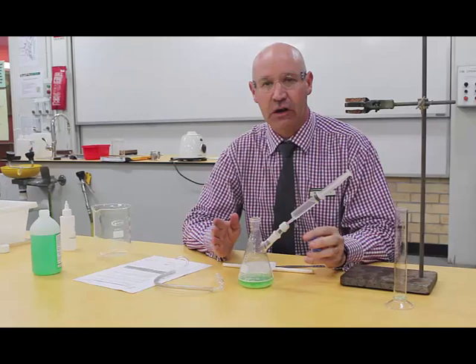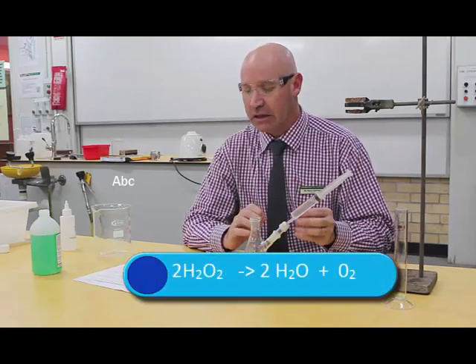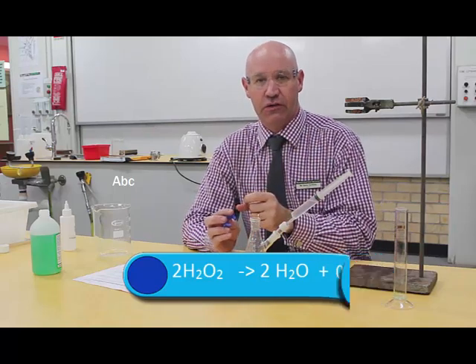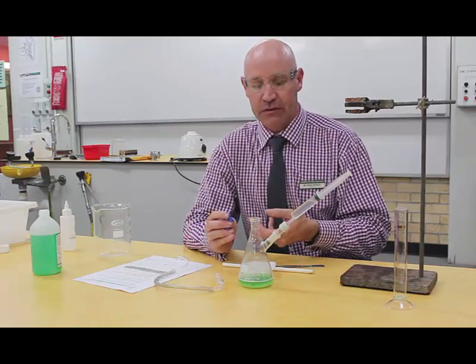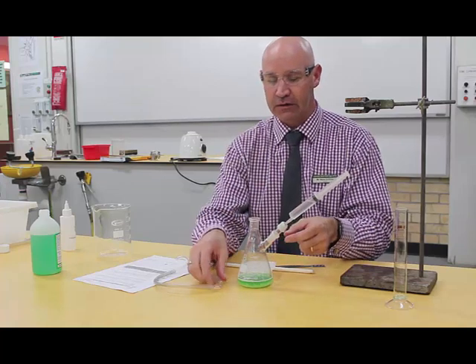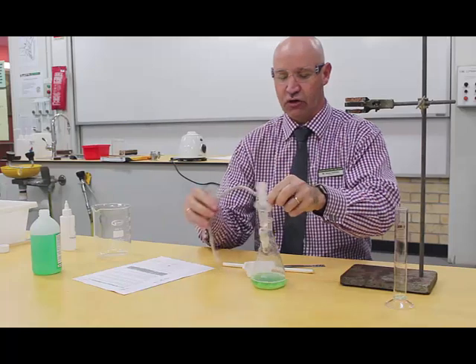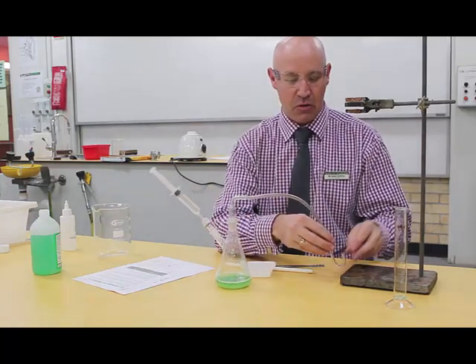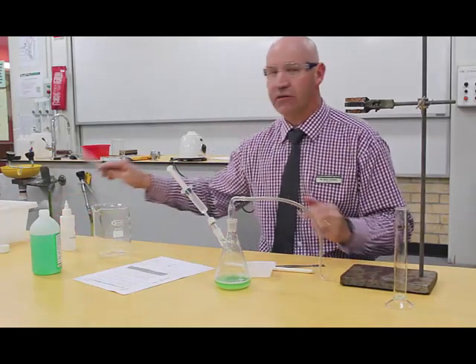So the hydrogen peroxide is going to be catalyzed by our enzyme catalase into water and oxygen. And the oxygen is going to be produced as an oxygen gas. And so the oxygen gas is going to be produced in this conical flask, and we're going to capture the gas, put it through this tube, and bubble the gas up into a measuring cylinder, and that's what we're actually going to measure.